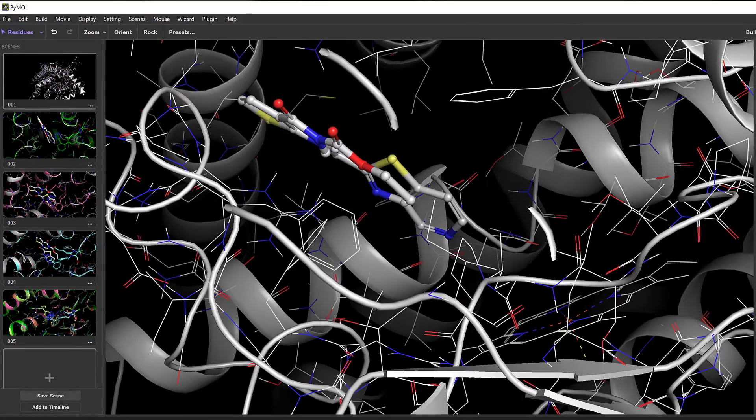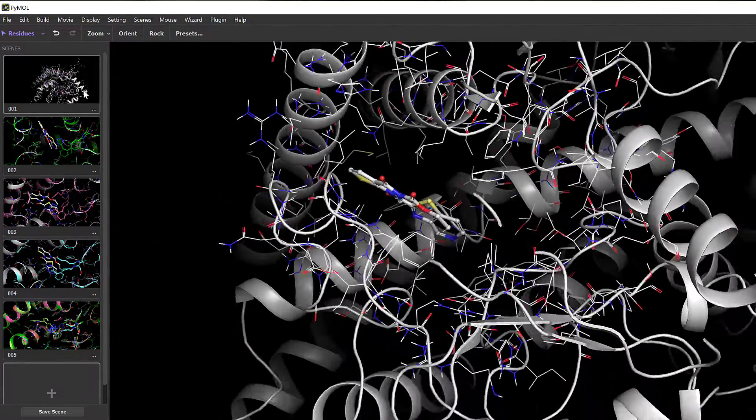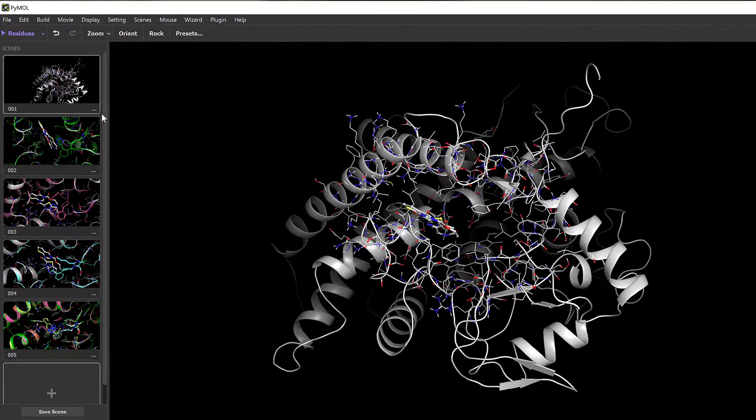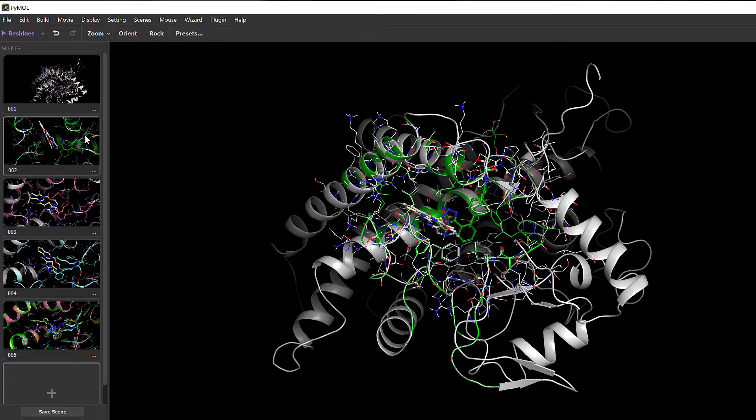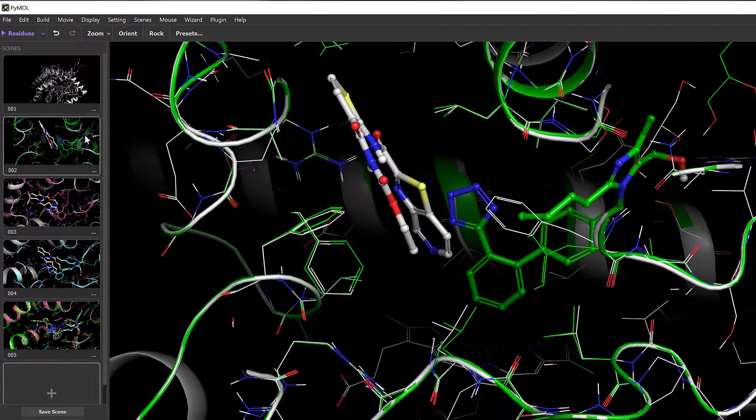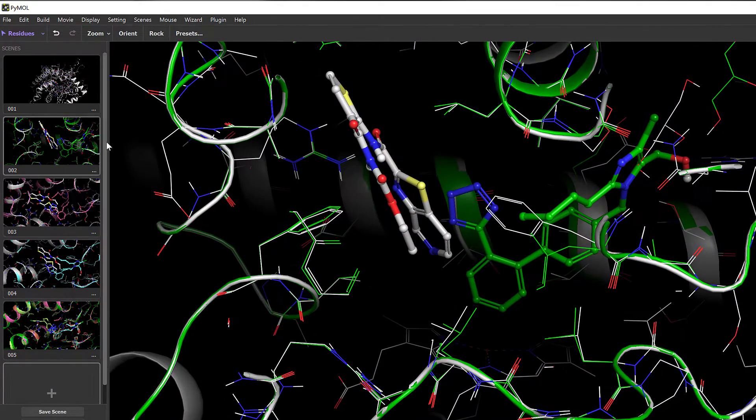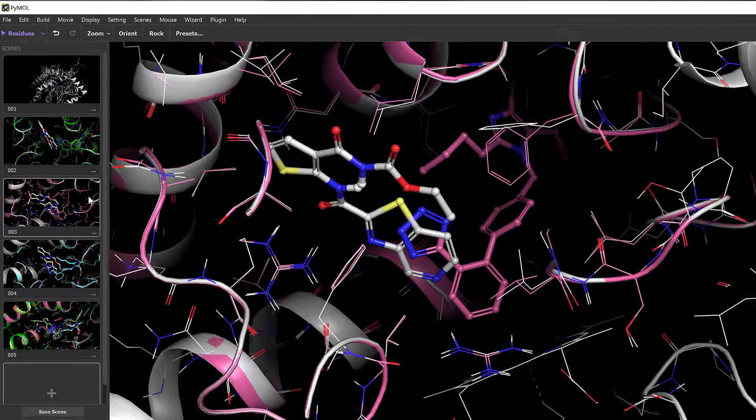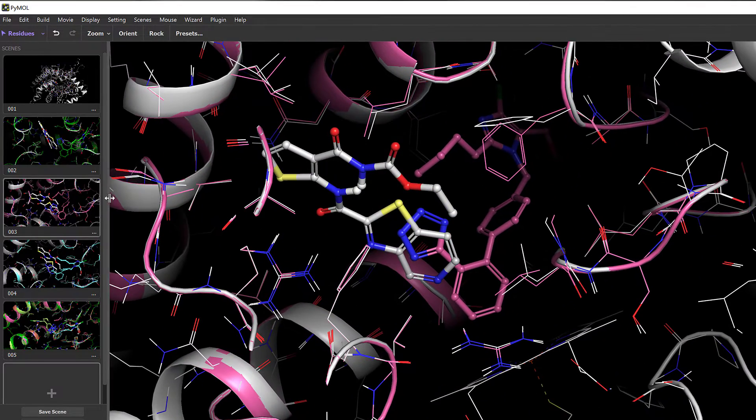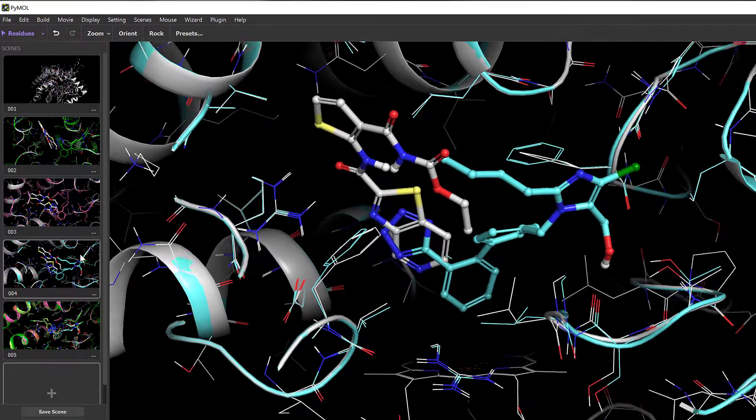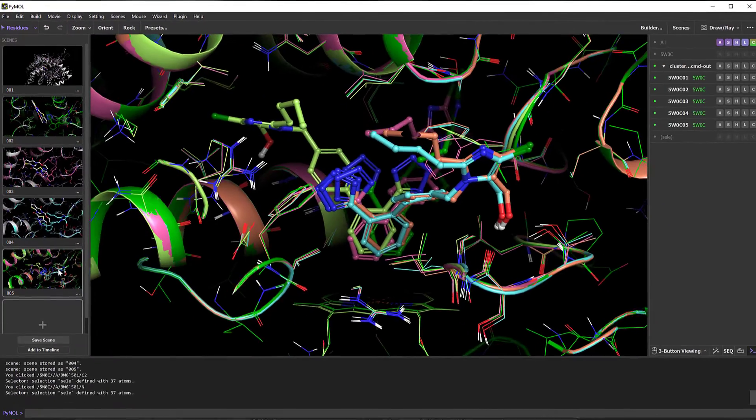Here we see an improved scenes panel, which now displays thumbnails for each scene, facilitating better organization and aiding in the creation of storyboards for animation. The example shown here is based on the output of IFD-MD calculations run previously back in Maestro.